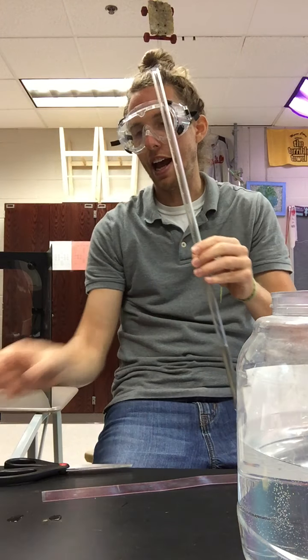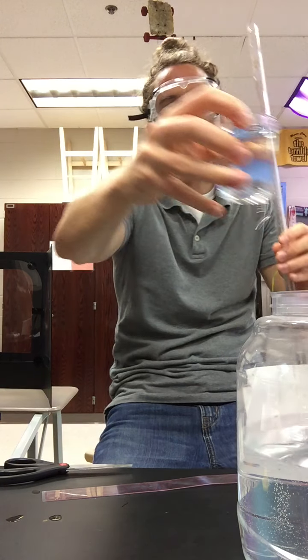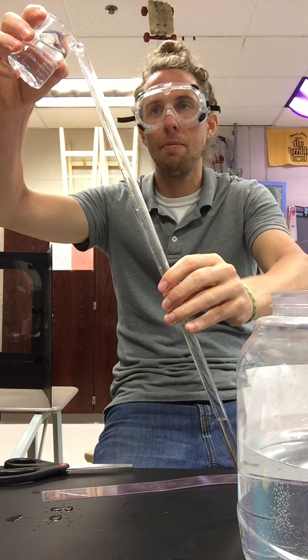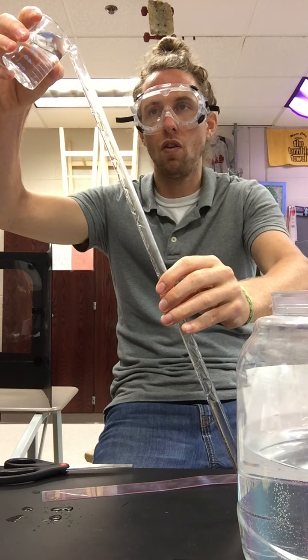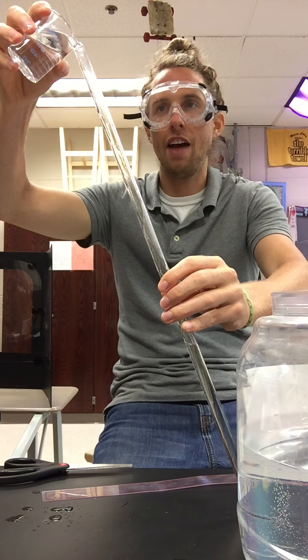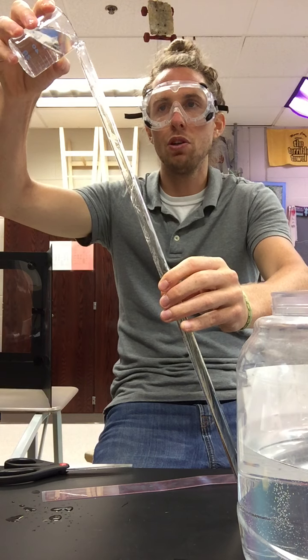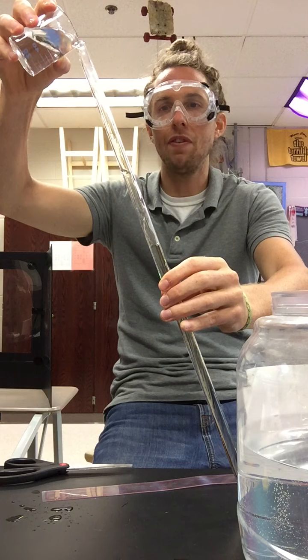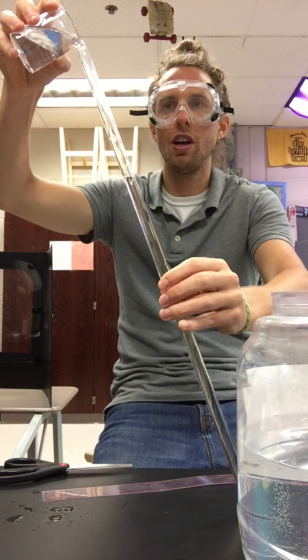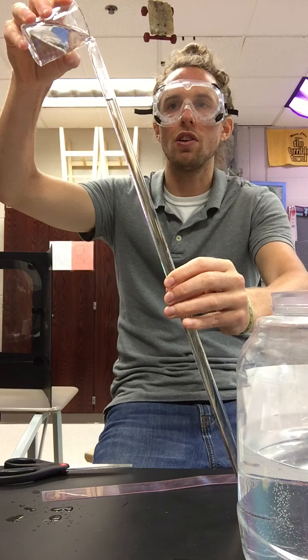To that hydrochloric acid, I am going to grab some water out of this container to make sure it's the same temperature. And that water I'm going to slowly pour into my eudiometer, and my goal is that the water remains on top of the acid. So I don't want the reaction to start until I have this eudiometer in my container, so that's why I'm pouring slowly here, so that for the most part the water is sitting on top of the acid. Now the acid is more dense than the water, so that should help to some degree, but even as we're pouring, obviously those things are going to start to diffuse through one another and mix.